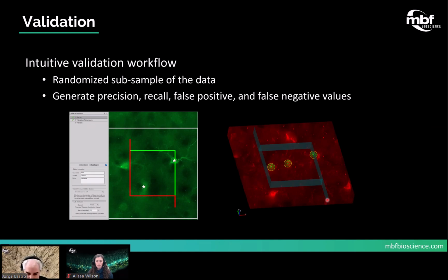There is also a 3D view window after you finish, which is very helpful to determine edge cases like this one, for example. Here we see 3 cells that the software has detected. These are the centroids, the tiny green dots. The green mesh that you see here is a representation of cell volume, more or less. And the yellow open circles are the markers that the software has placed.